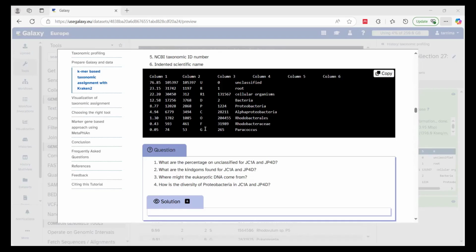I can give you an example so that you can understand this simply. Imagine you are at a big family reunion and an old relative you haven't seen for a long time spots you and says you're definitely from the Omara family. That's my family name, based on some facial features.